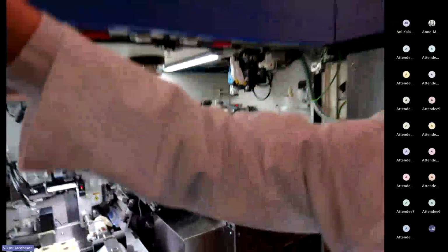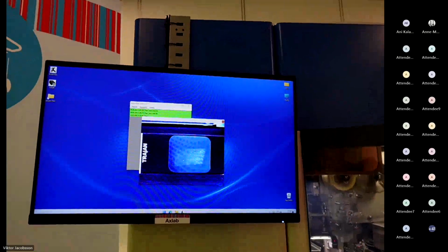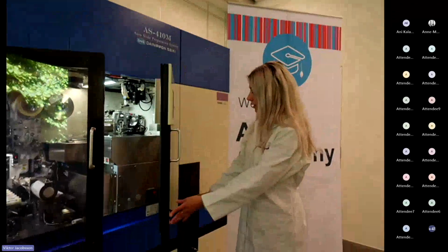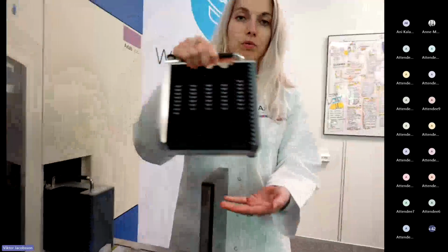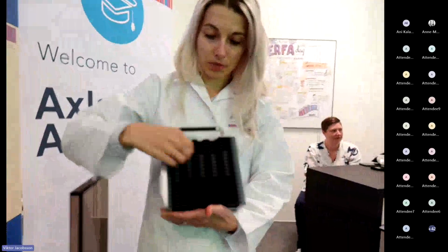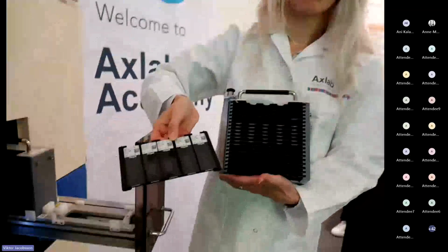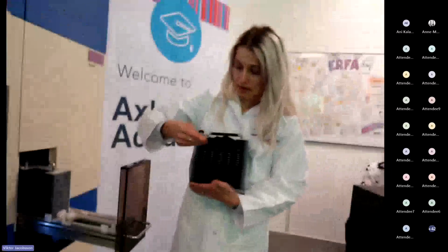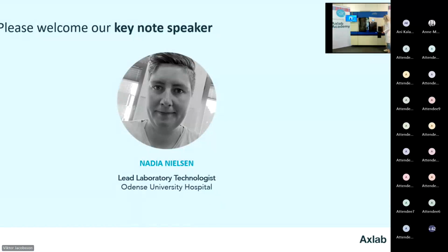If we take a look at the screen here, we can see this is a blade mark picture captured on one of the sections. After extension, it will go to the dry chamber that is heated, and here it will be stored until unloading. And here you have sections coming out. So this is the process the block goes through inside this system.